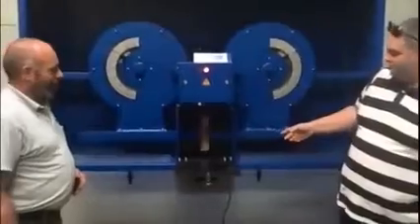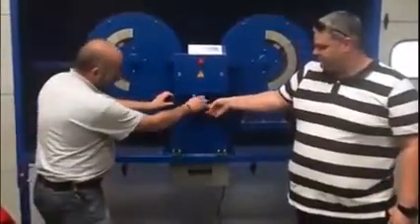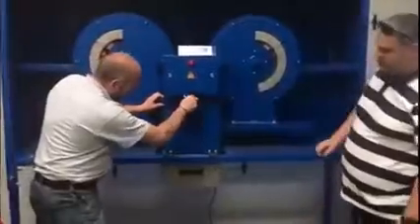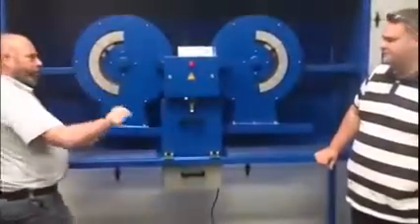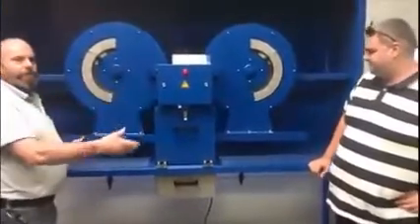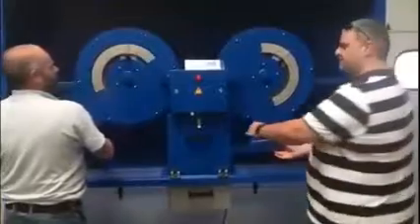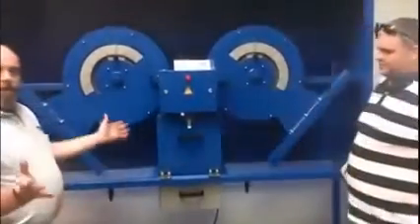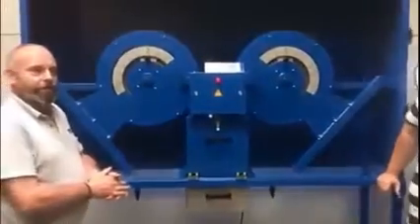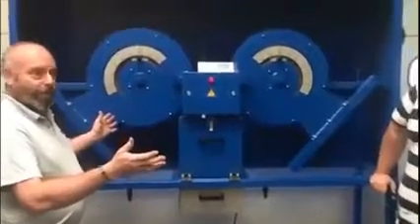We have the material that we have to test. This system now is working with magnets, so it's easier than the original system from Bond where you have to pull a handle. With this it's simple — lifting the hammer until it touches the magnets, and because of this it will stay in place.